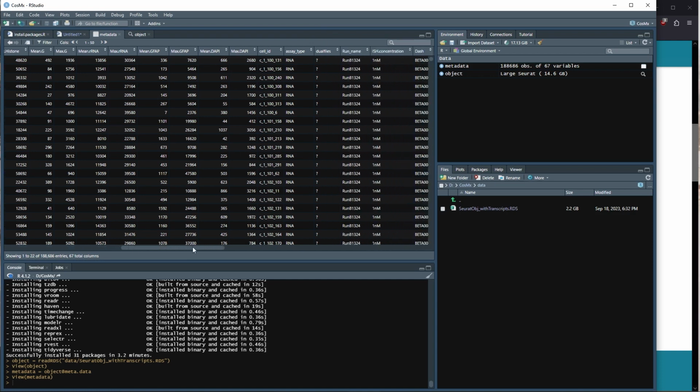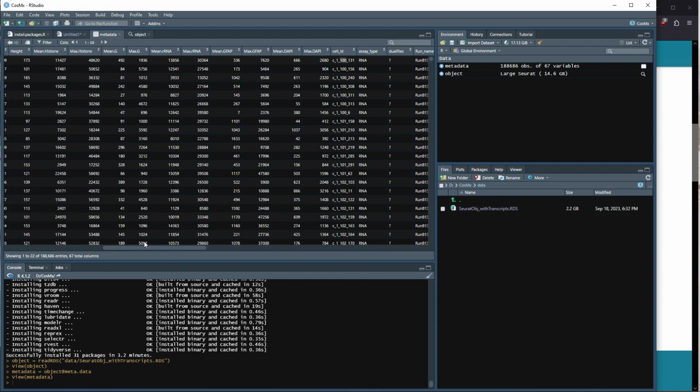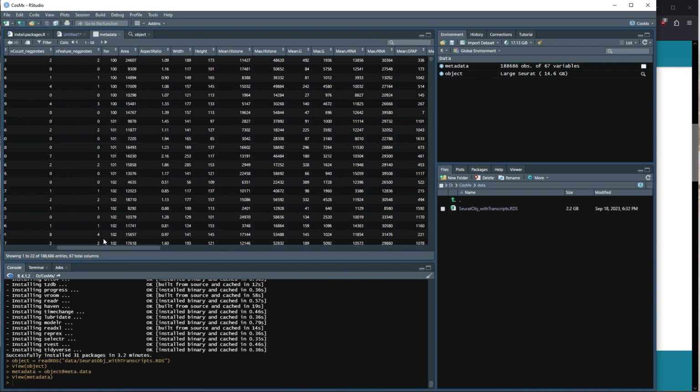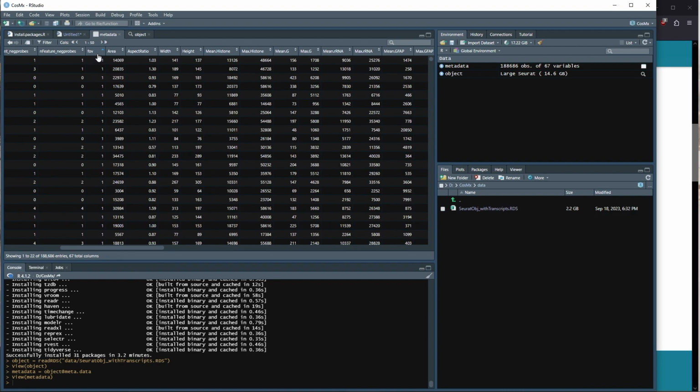When we look at our cell ID, we can see that we have some information here. This last one is going to be our cell. This middle one is going to be our field of view. So if we go back over to a field of view, we can see this first couple here are 100. Let's see if I can sort by this. There you go.